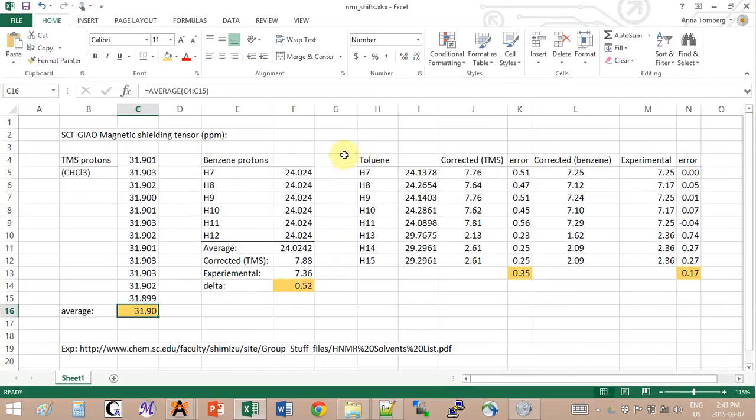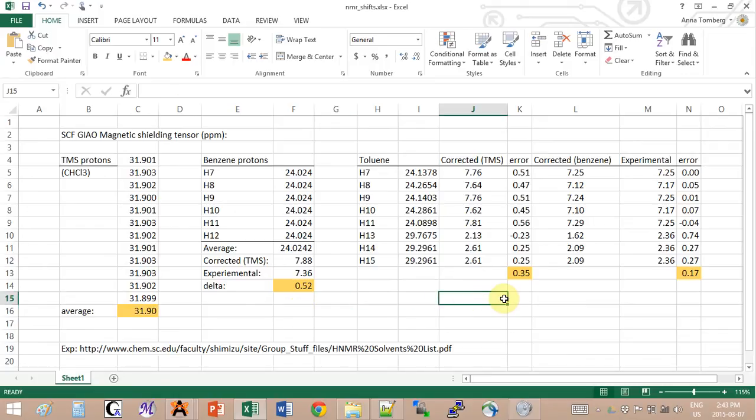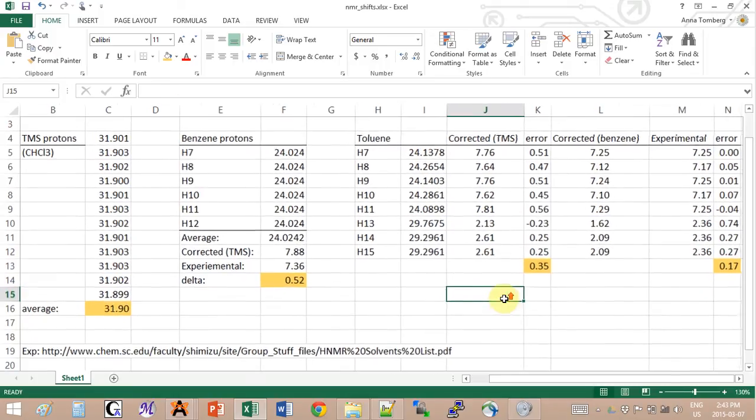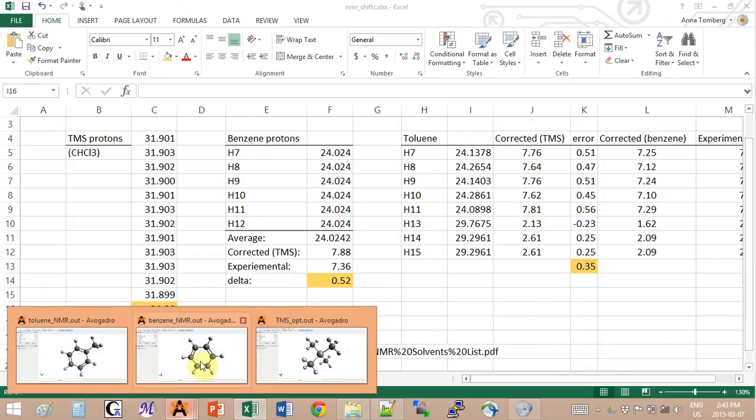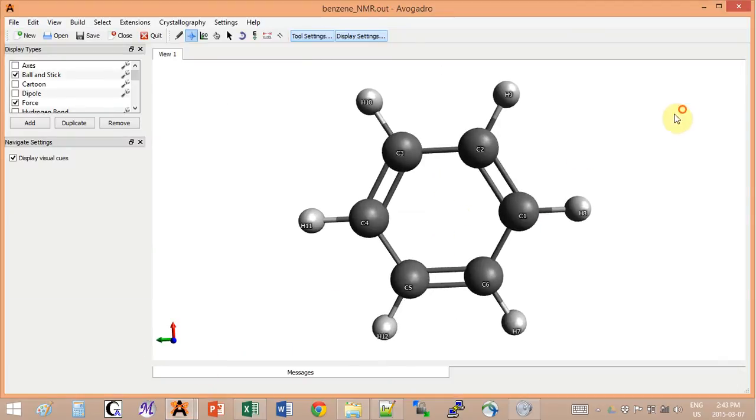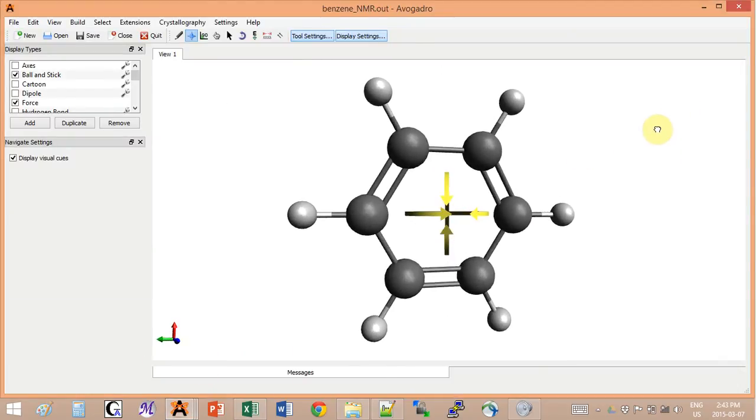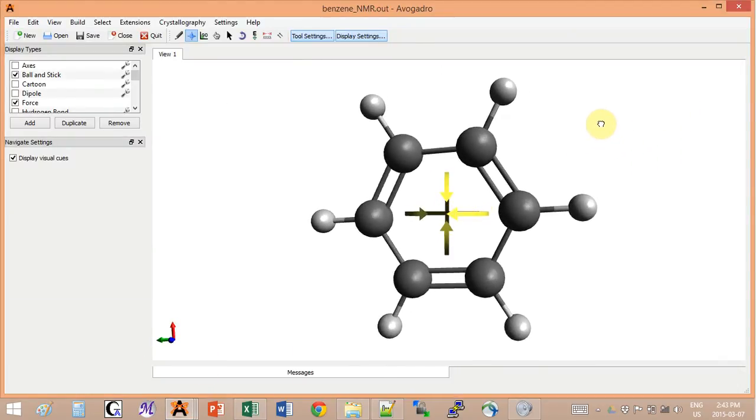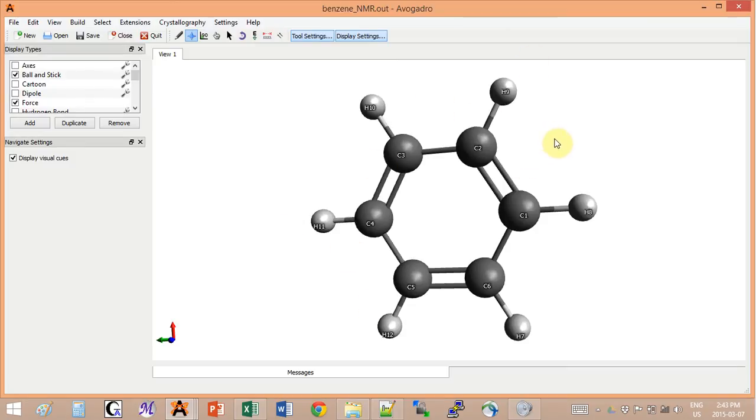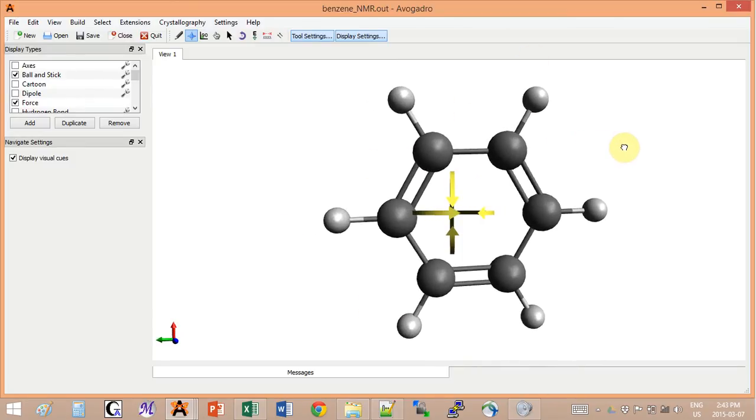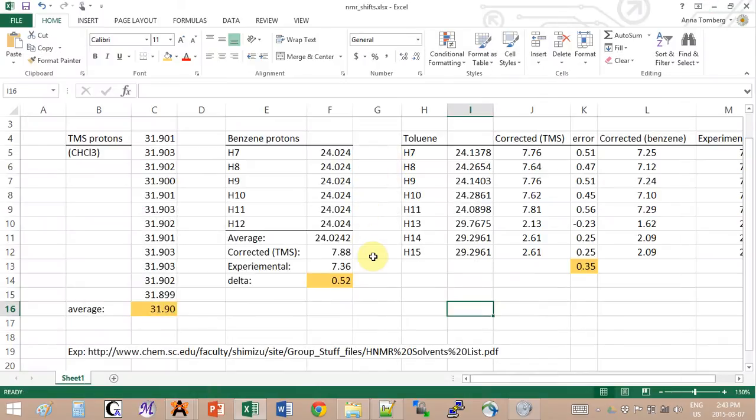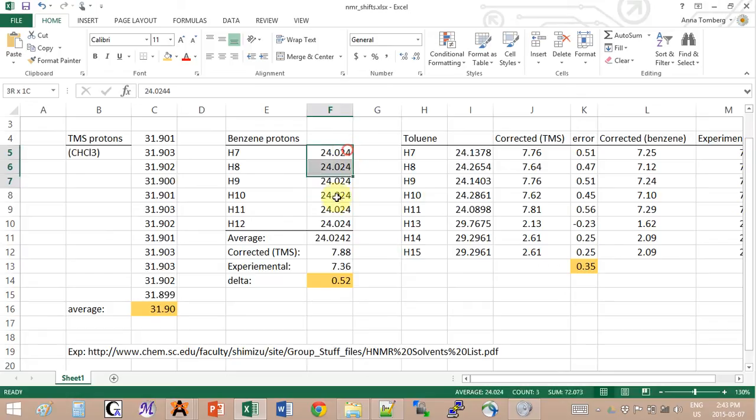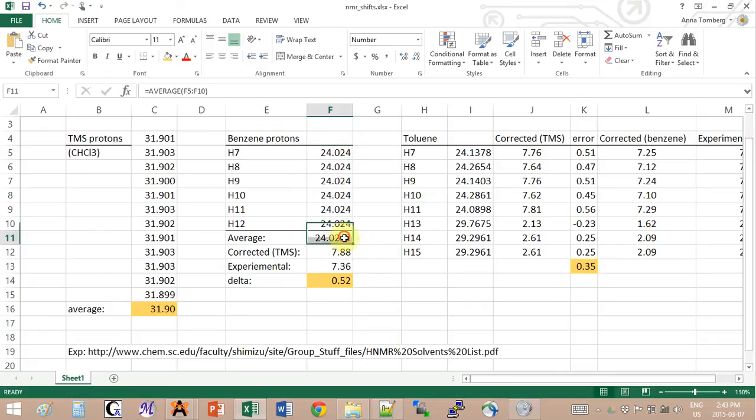I also copy pasted all of these protons into my Excel spreadsheet. So let's look at the results because that will allow us to get to some cool insights. First of all, benzene's protons have all the same environment. They see exactly the same thing as their neighbor, and therefore you would expect them to have all the same shift.